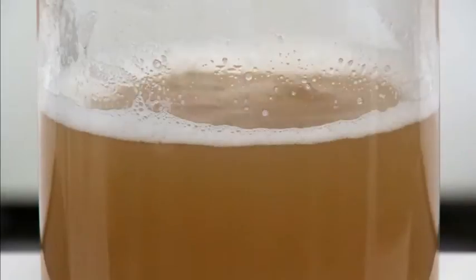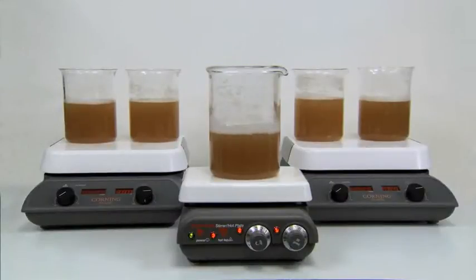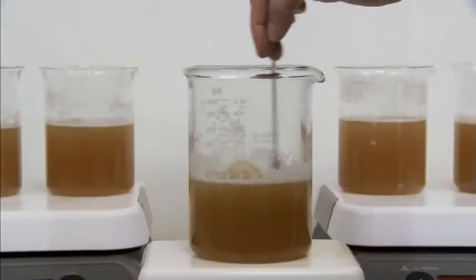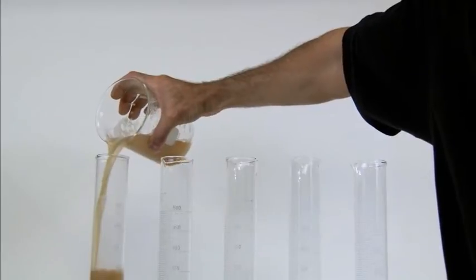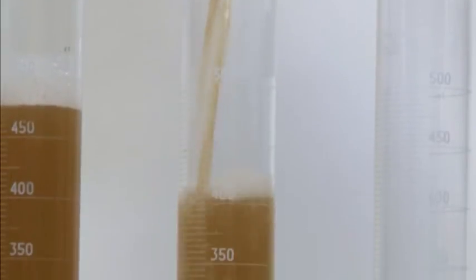A wort sample is collected about ten minutes before the end of the boil. Five beakers are filled with equal amounts of wort. Polyclar Brewbrite Stabilizer is then introduced into the wort in doses ranging from 10 to 25 grams per hectoliter. One beaker is left untreated as a control. The samples are transferred to graduated cylinders for cooling. After cooling for one hour, clarity is assessed.